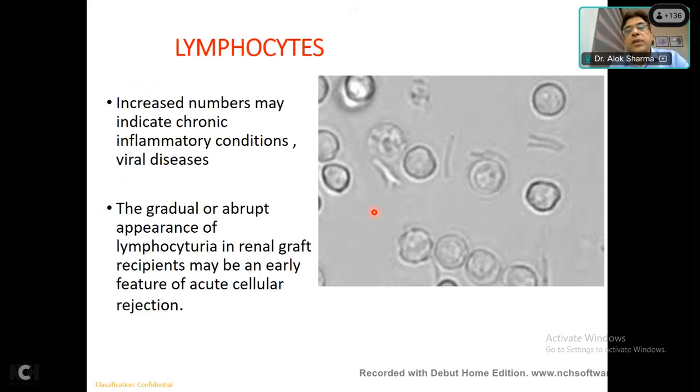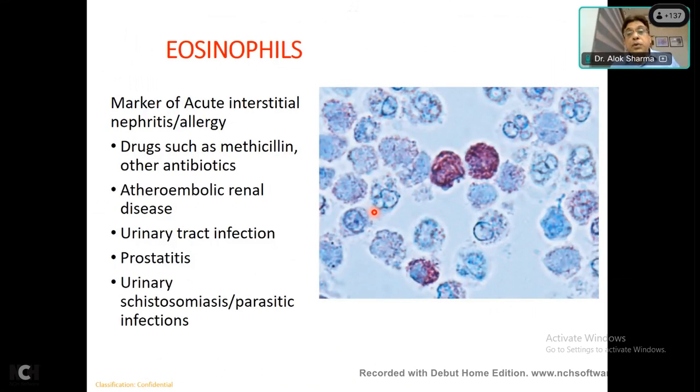So neutrophils will not appear mononuclear, they will usually appear lobated, but you can identify them by the granules in the cytoplasm. Lymphocytes will not have granules, neutrophils have granules. Now eosinophils, I have told you earlier, I think a couple of times already, are very important when you do a urine examination and do a Hansel stain. The importance lies either in detecting an allergic response, or, in terms of kidney biopsy, you see a good number of eosinophils when there is an acute interstitial nephritis.